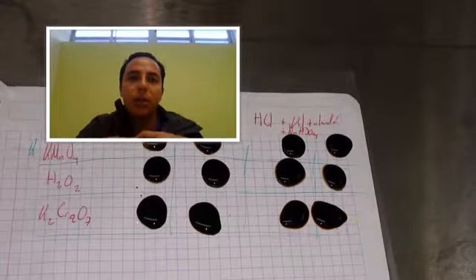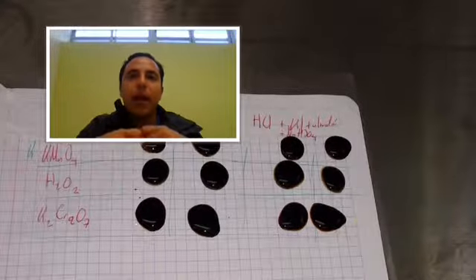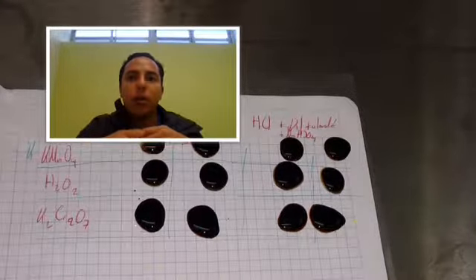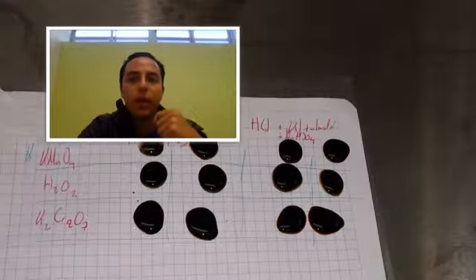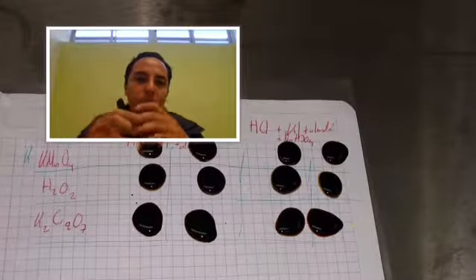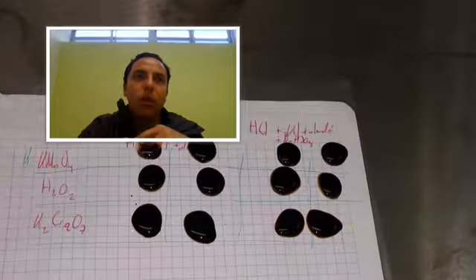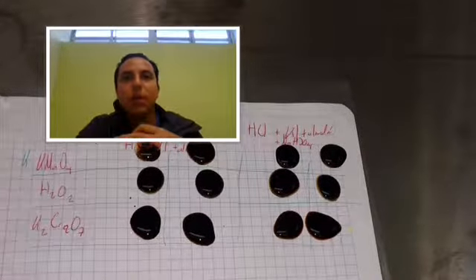In this case, the color changes. The ion I2 undergoes the concentration change and changes to a blue color in a certain period of time. It depends on the concentration and the time.